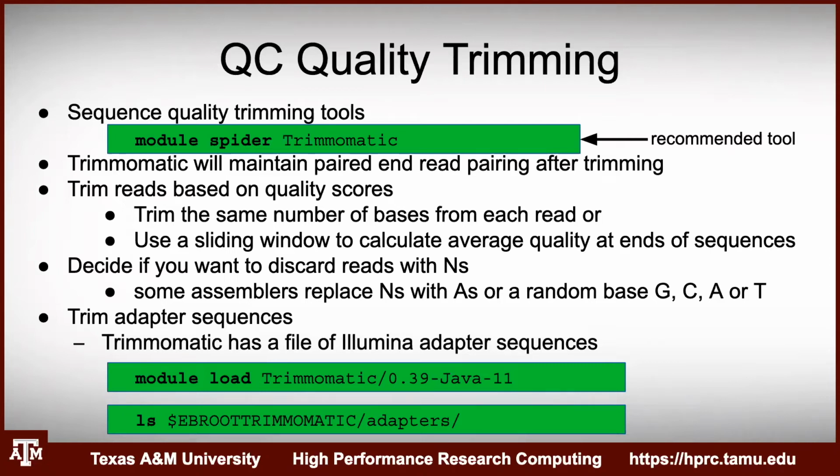So for RNA-seq studies, if you're doing something like a differential expression study, you really want to keep your trimming light, because if you trim heavy and trim too much, then you can actually decrease your mapping rates because you'll get a larger number of non-unique alignments, right?